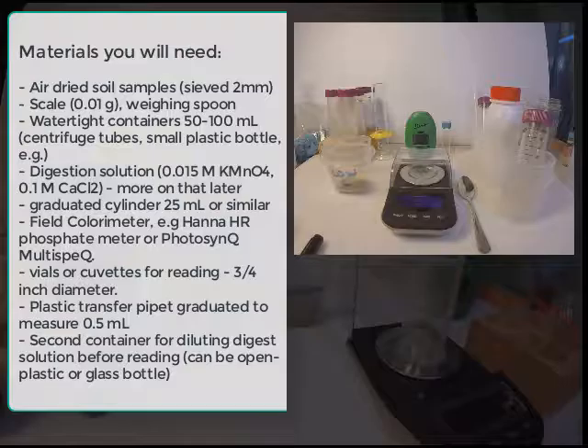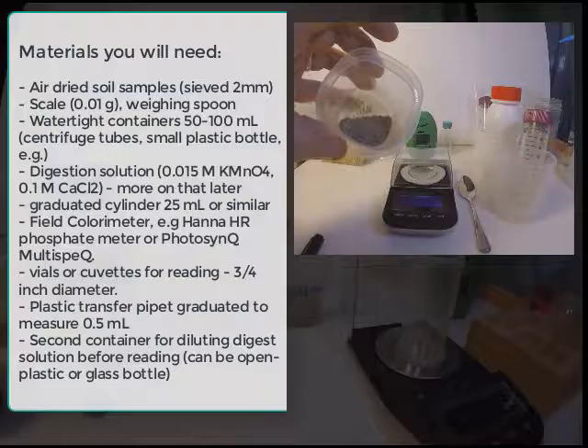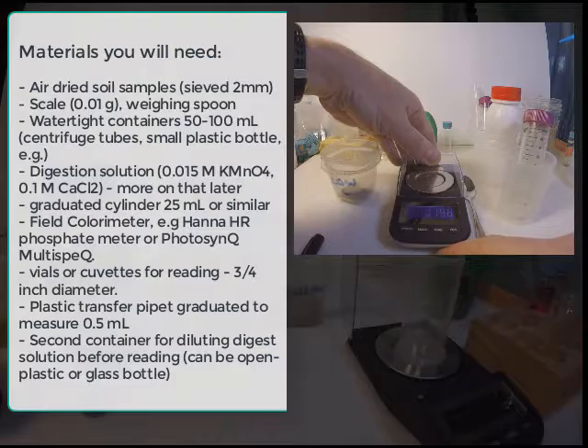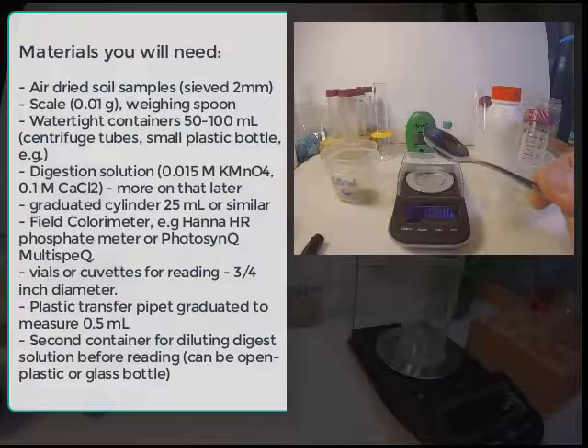These are the materials necessary for the active carbon test. First, we have air-dried soil — we usually do it on air-dried soil. We have a balance accurate to one milligram; one one-hundredth of a gram is also fine. We also have a spoon or spatula for weighing out soil, which is important.